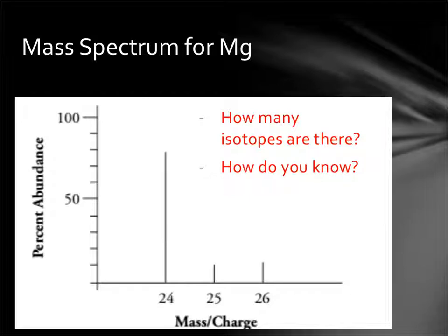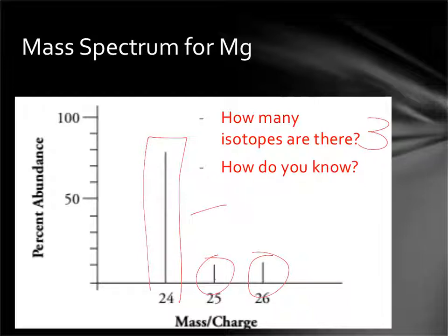And so each line is an isotope. And then also notice the length of each of the masses. So the most prominent isotope has a mass of 24, and then we have about equivalent amounts of 25 and 26, which are super low. I mean, we're talking about 10% each, it seems, and then this one's 80%.